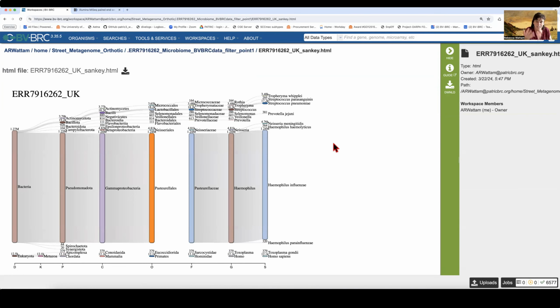It gives you a visualization of everything in that data. The MultiQC report was one thing, but this gives you the taxonomic spread right before your eyes in color. And we're primates, right? We like color and it helps us see things, and here it all is. So along the bottom, we have the taxonomy and the different levels: division, kingdom, phylum, class, order, family, genus, species.